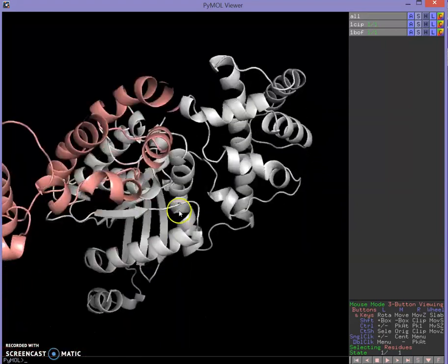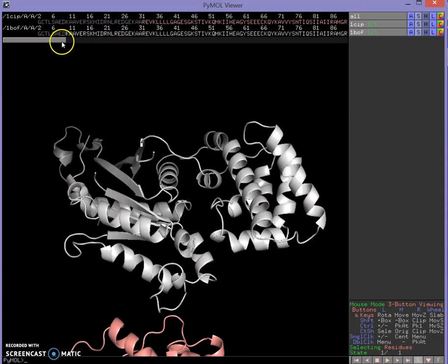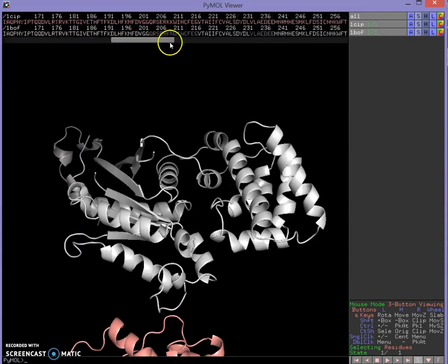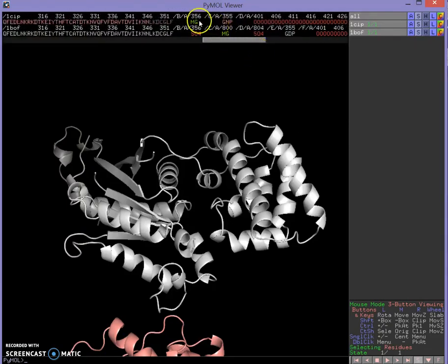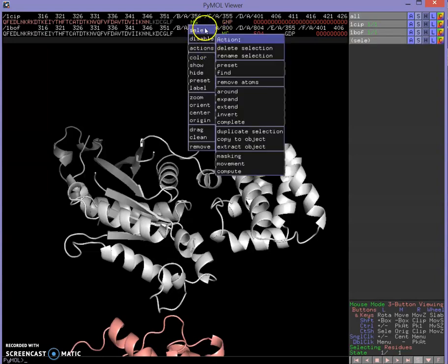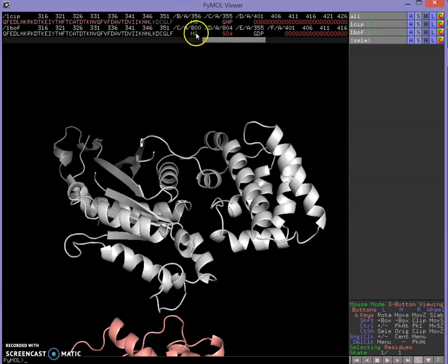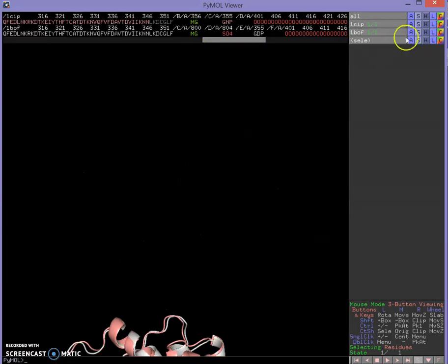Now we've got both structures but we need to align them. First, bring up the sequence viewer — that's the 'S' button down in the corner. Since they're the same protein they should look really similar, but we're looking for the magnesium, which is the actual catalytic piece of our protein. We'll right-click the sulfate that's in the wrong place in the alignment and remove it so our magnesiums line up. Then type 'align 1BOF, 1CIP' to put them in the same place.